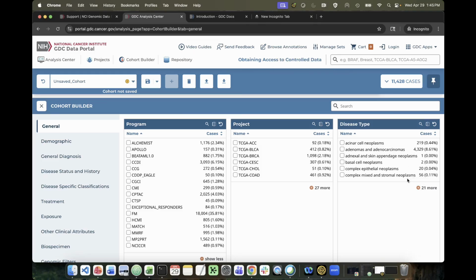All right, so the next question, is de-identified data available to international medical students for research? And the answer to that is yes. Everything that I'm showing you right now and everything that Shin showed you is available as open access. So if neither of us logged in, everything that I'm doing now can be done just by going to portal.gdc.cancer.gov.